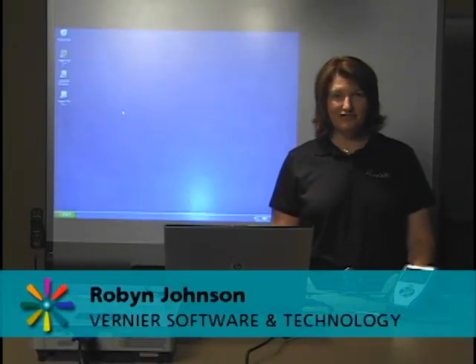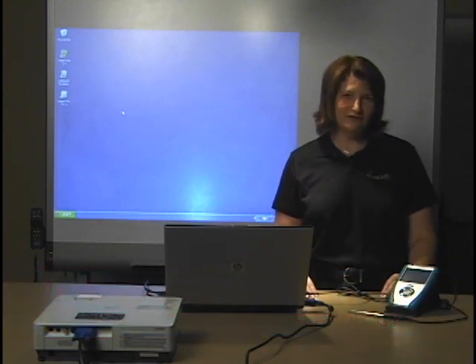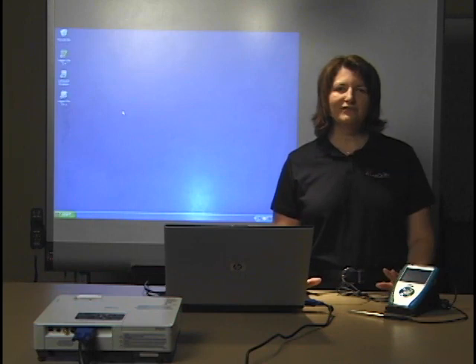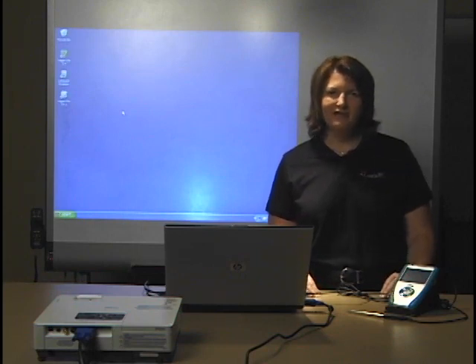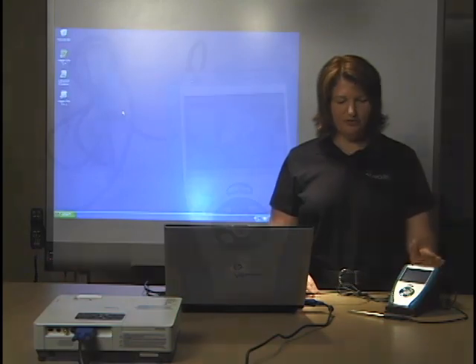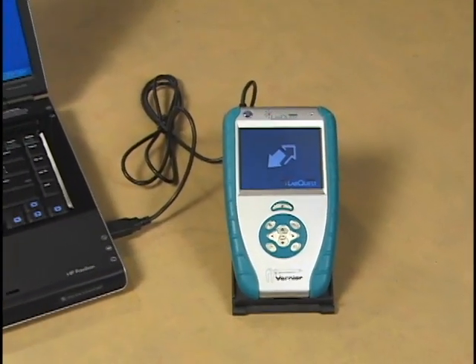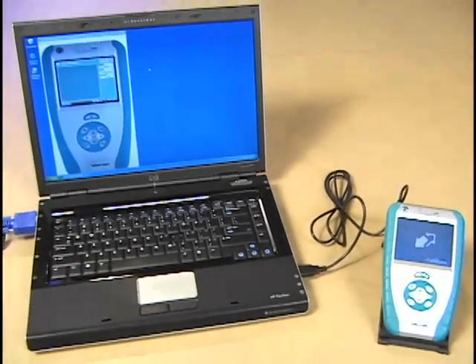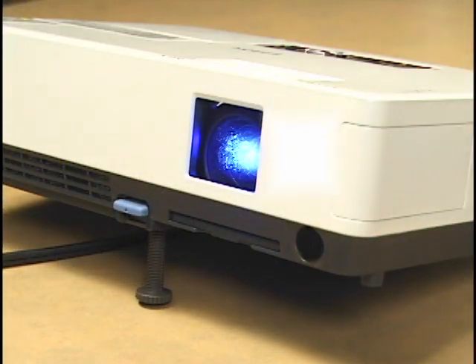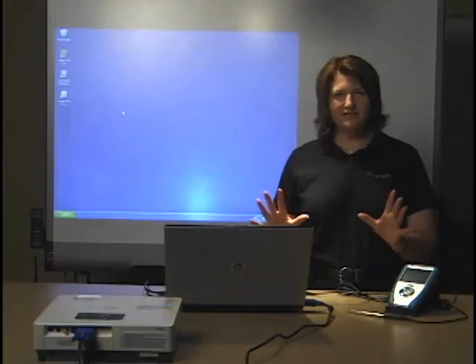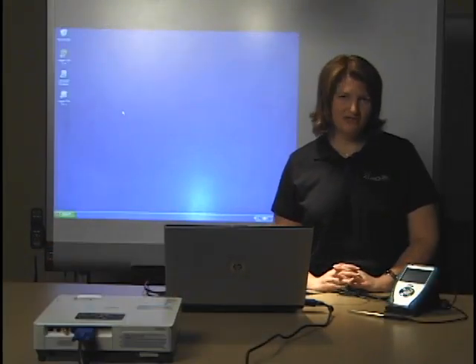Many people have asked how they can project their LabQuest screen onto the wall so the entire classroom can see it. We've come up with a way to do that using computer software called the LabQuest emulator. Your LabQuest is connected to the computer through the regular LabQuest USB cable, and then the computer is attached to the projector using the standard projector cable. This way, everyone can see the image of the LabQuest on the screen.